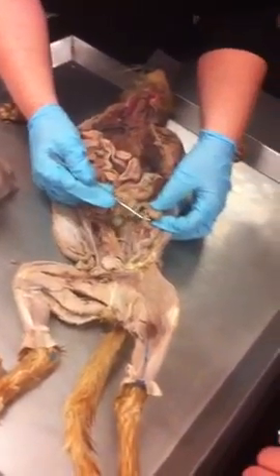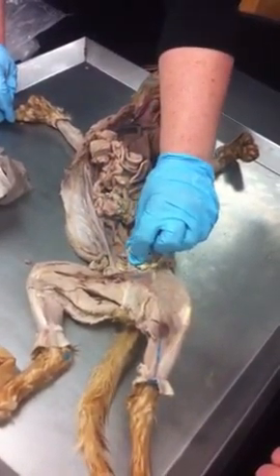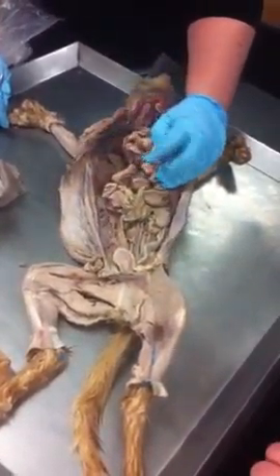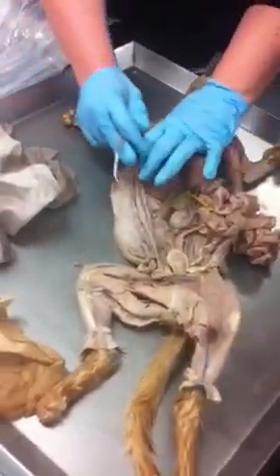What's this thing? Ureter? Yeah, ureter, and then it goes to the bladder? Yeah. And from the bladder on out, what structure is that? And of course you want to identify every single organ. I think that's pretty easy.